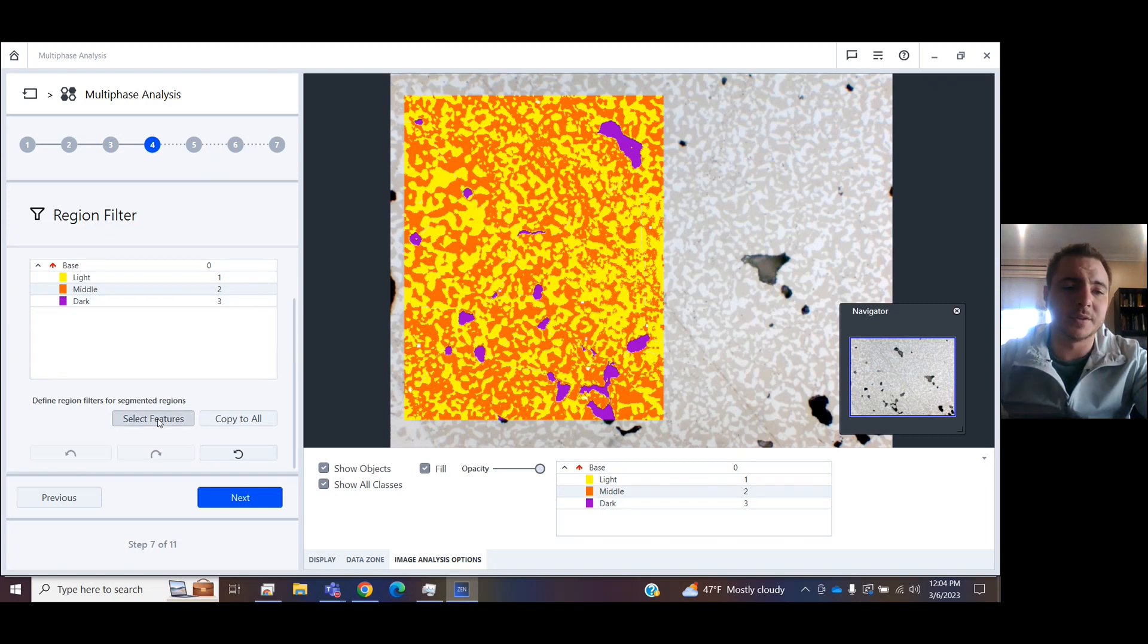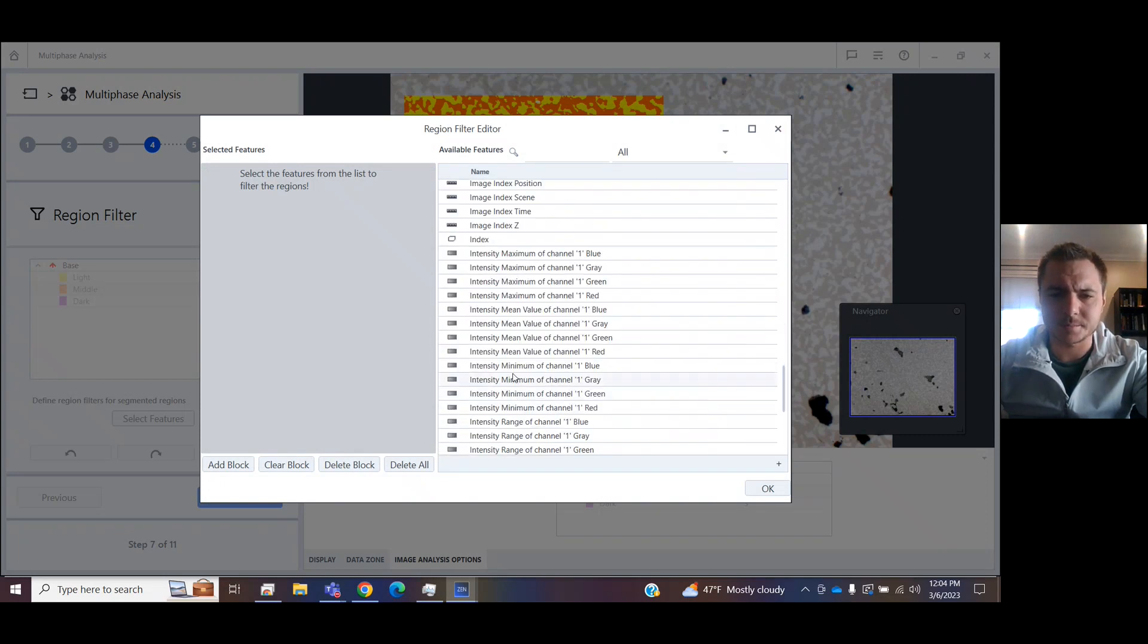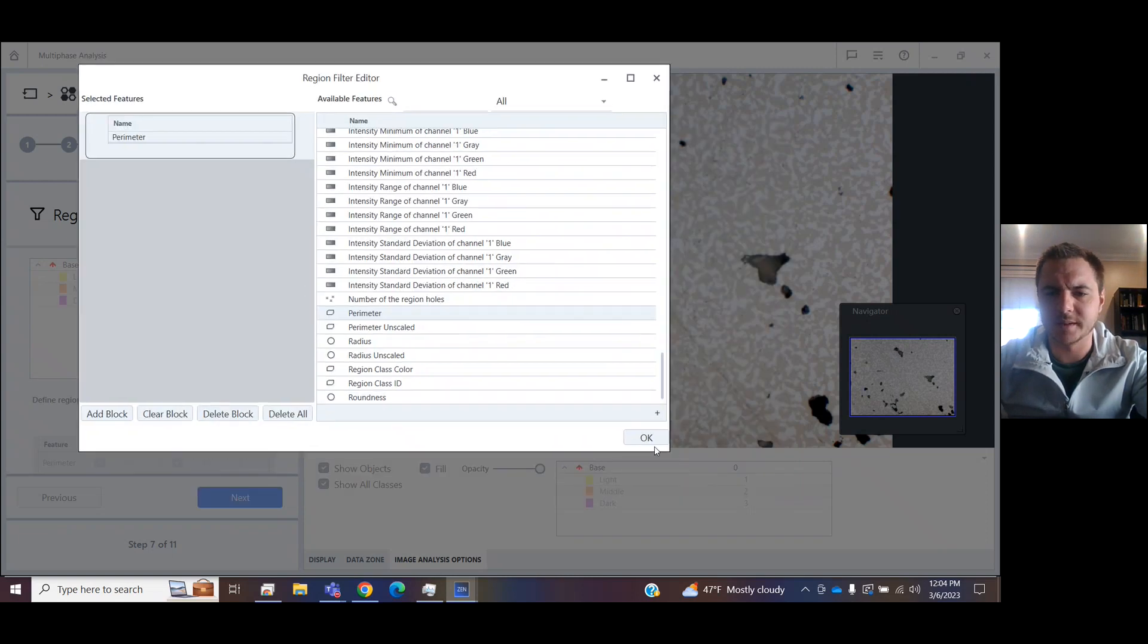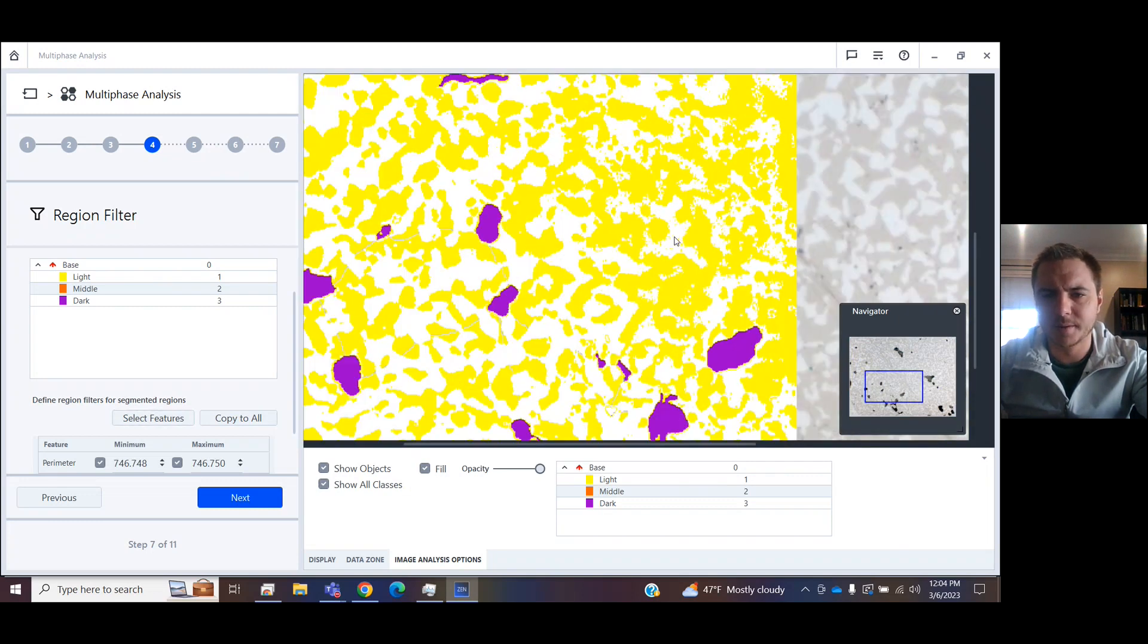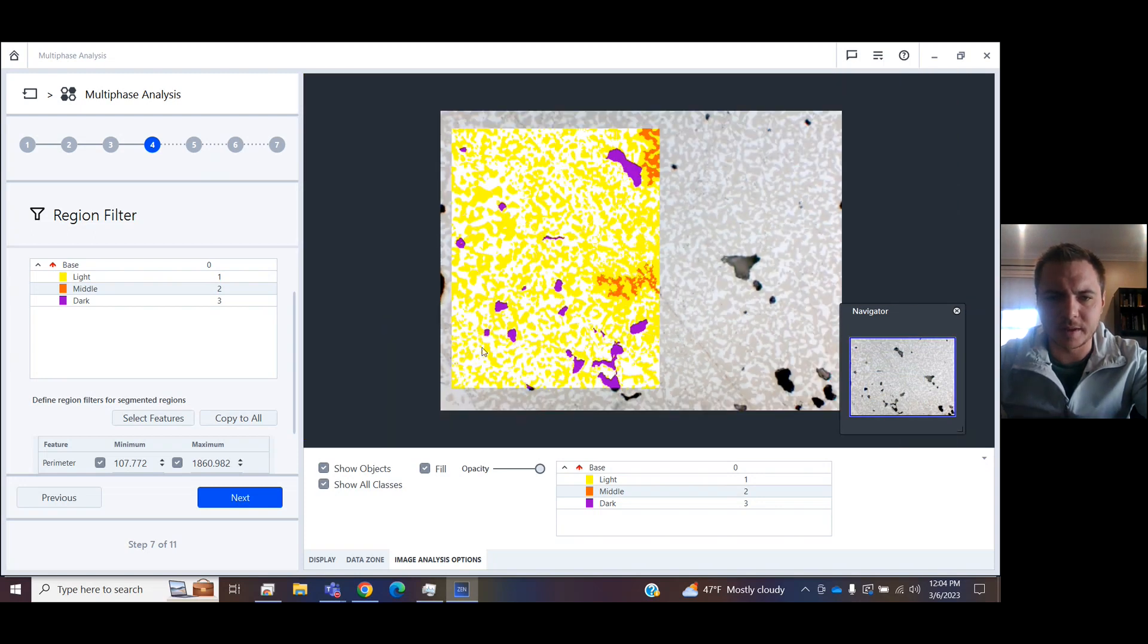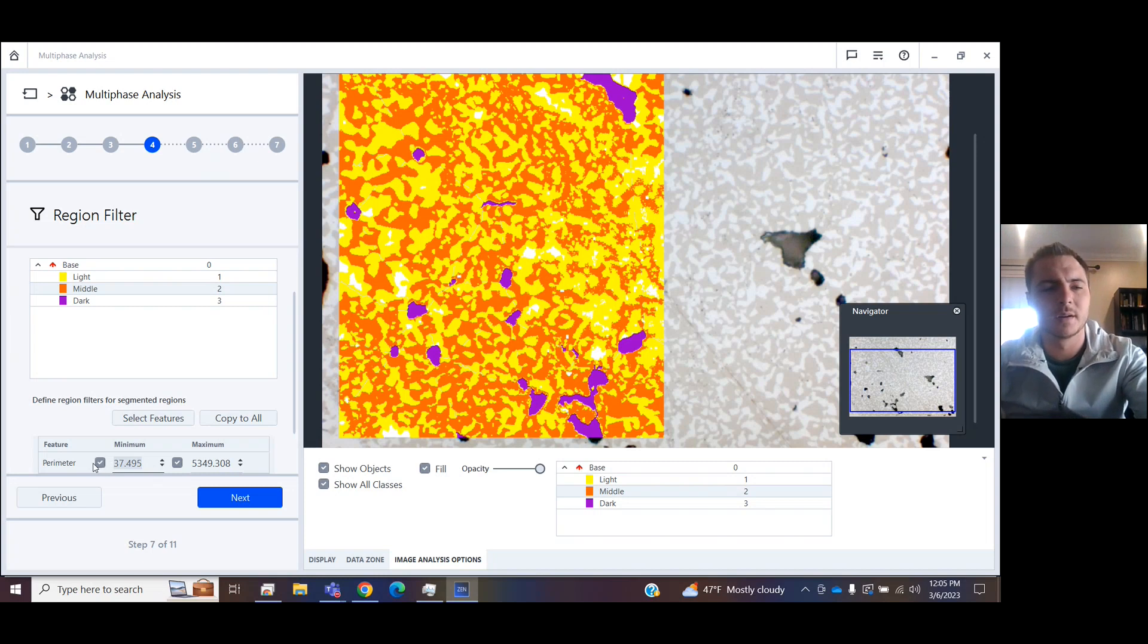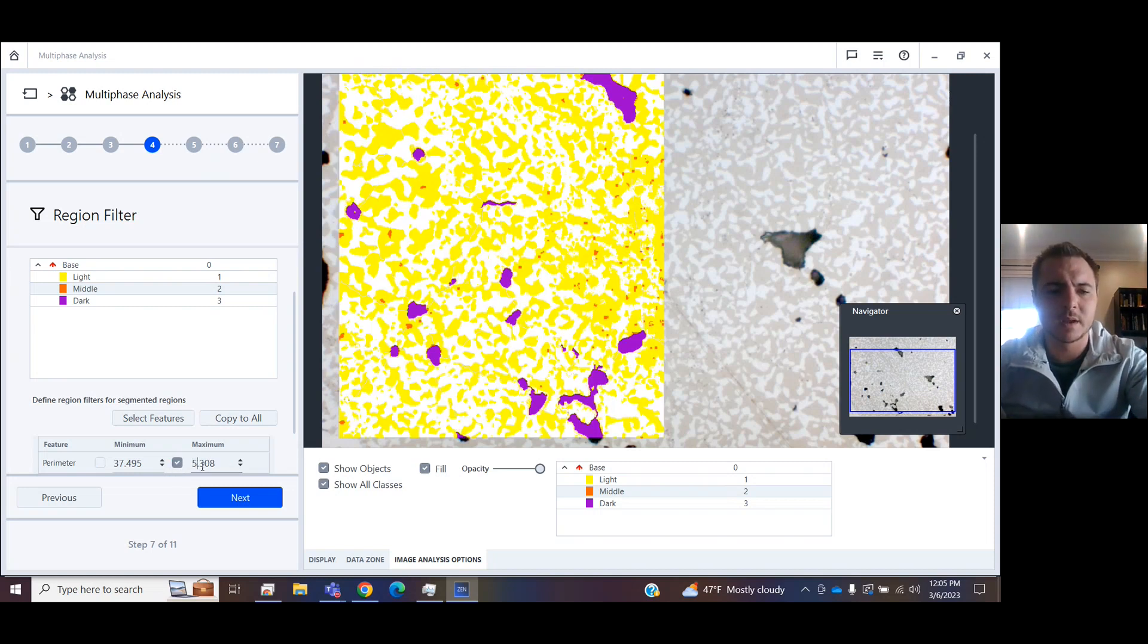You can also add other features separate to other classes. Let's say in here I wanted it to have a certain perimeter. As an example, I can now go into the middle class, select the minimum, select the maximum. My computer's catching up with me a little bit, but you can add and subtract and watch how my minimum values change in there. You can also get rid of the minimum entirely, or you can make that any number you like.